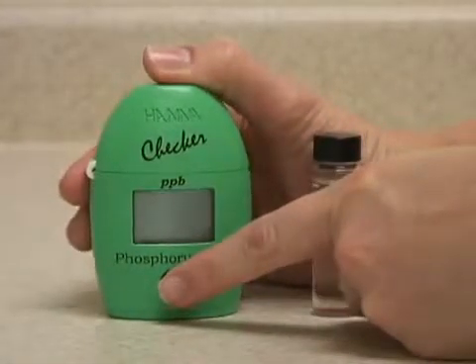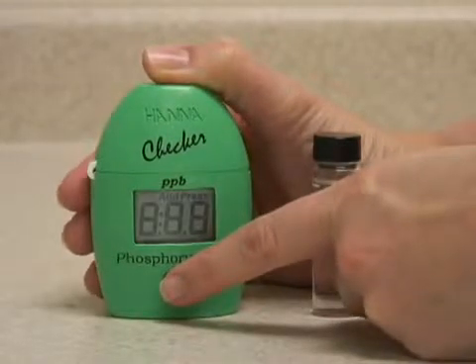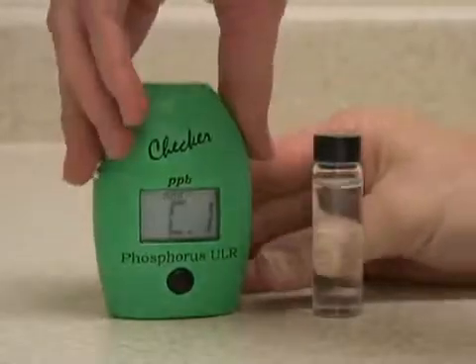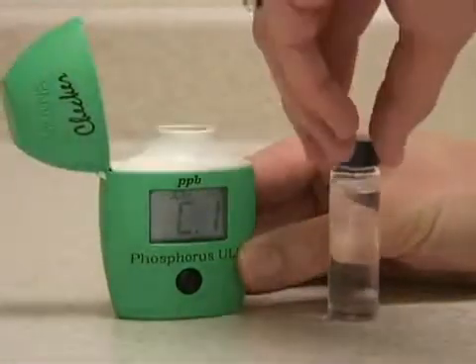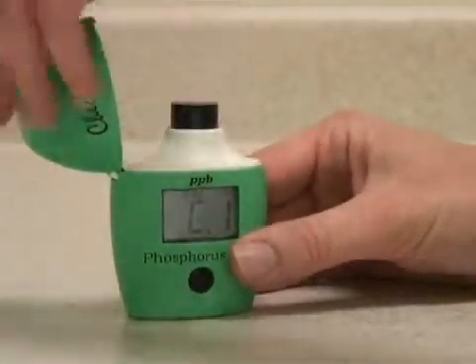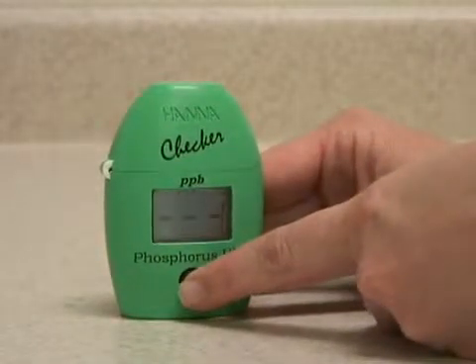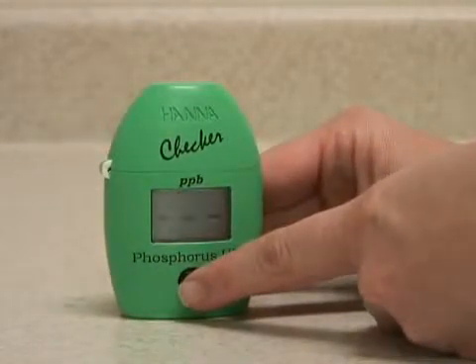Press the button once to turn it on. As it displays C1, insert the vial to zero the sample. This contains your unreacted water. Press the button again to zero the instrument, which calibrates it to your water.